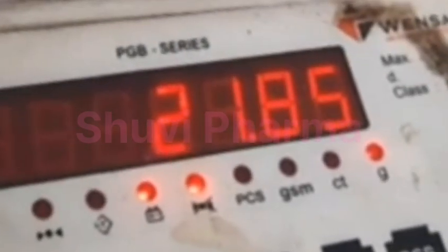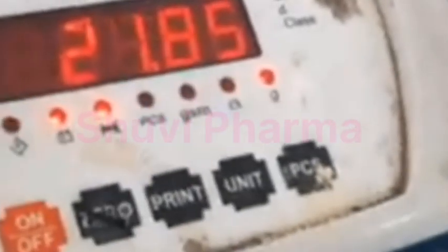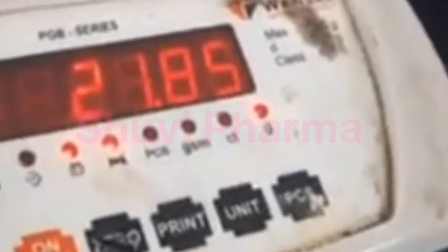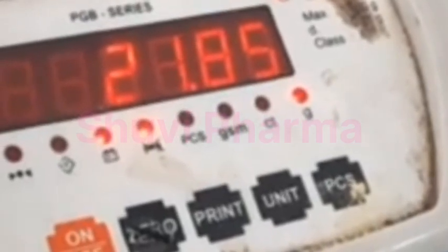So the weight obtained is 21.85 gram with total ash. Now we will divide this total ash in two parts and we will perform acid insoluble and water soluble ash value.